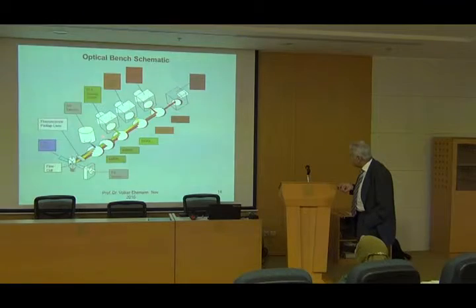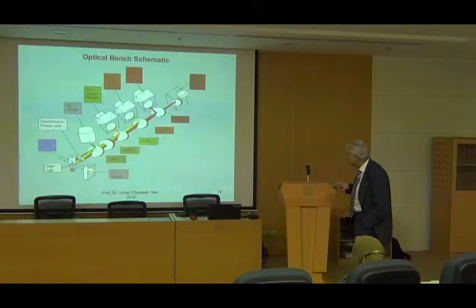And you see filters which are built inside. At first all colors will come through these filters, and the green is selected.